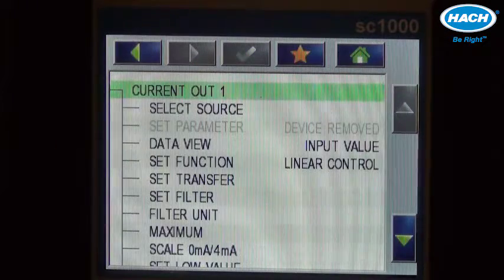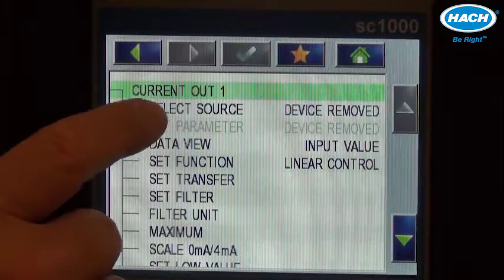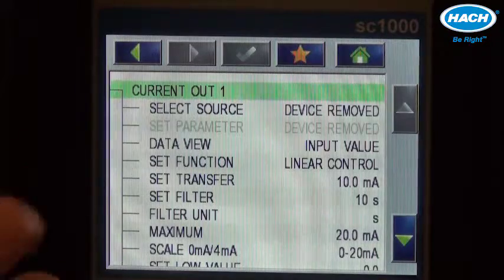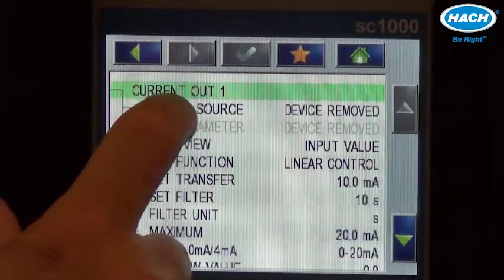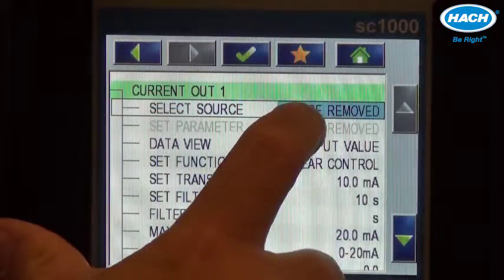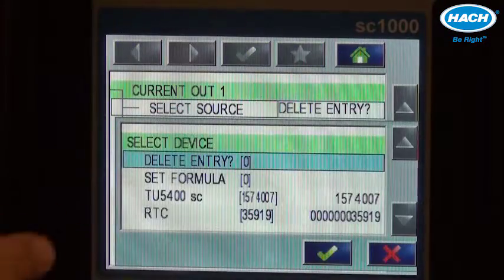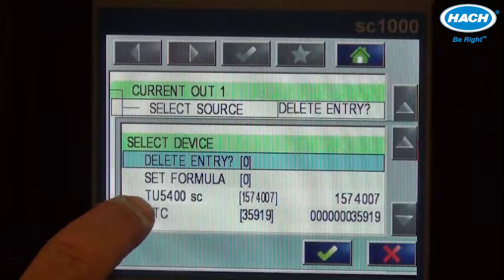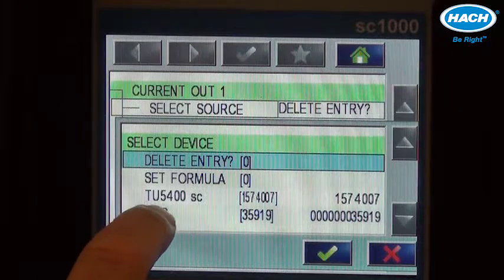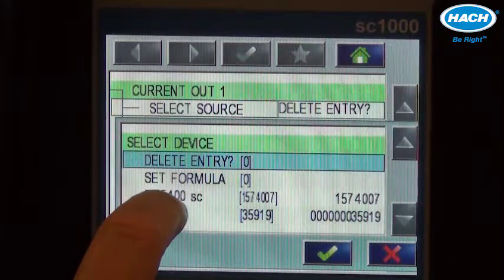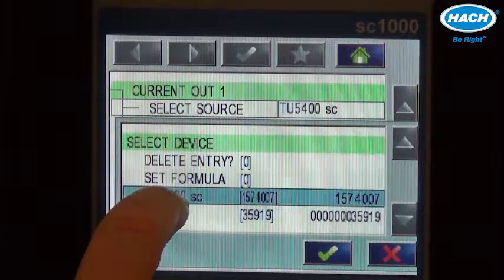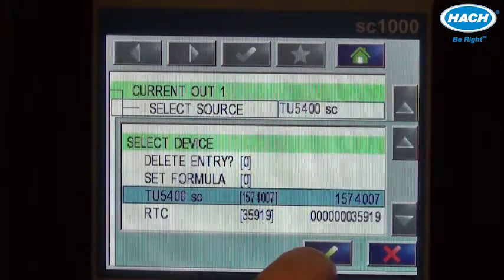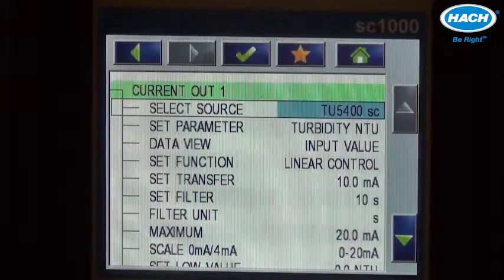Configuration is easy. It starts with selecting the proper source. The source, in this case, is the sensor that we're working with, the TU5400SC. So we'll choose that and press the green check mark.